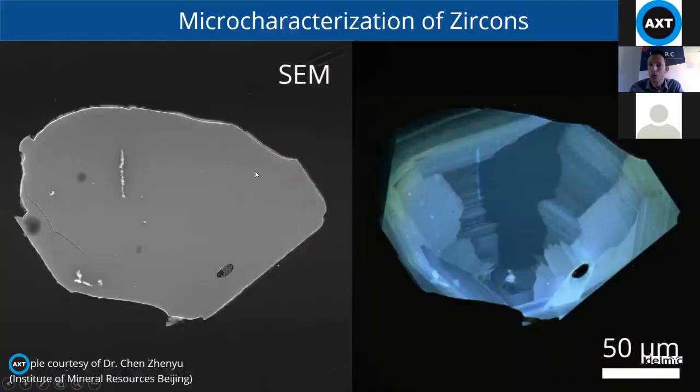So this was the first example, of sedimentary rocks, and of course the examples that I show you can also be extrapolated to other mineral types. I showed an example of quartz sandstone, but you can do all of the things I showed also for carbonates or the other types of rocks that I mentioned. So please keep this in mind.